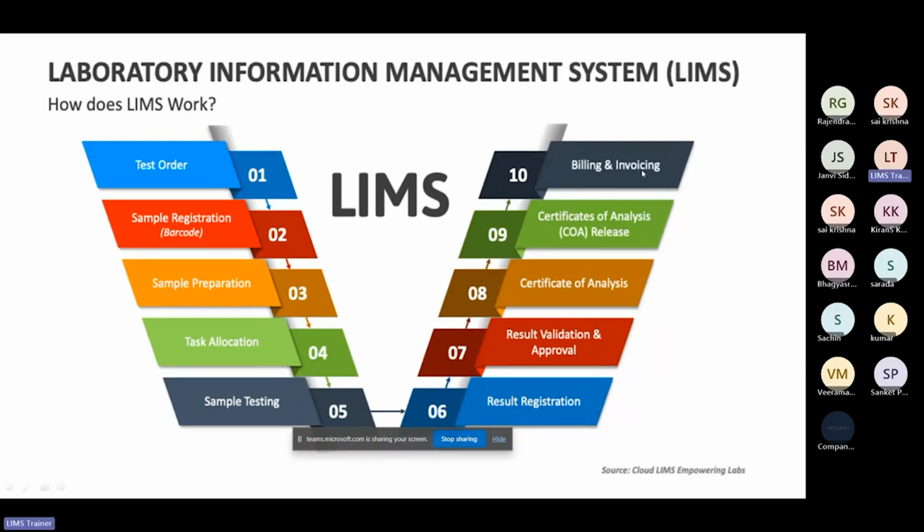Do you all understand validation? Can anybody tell me what is validation? Validation means before going to routine use, you have to validate our software. Here I can say software, LIMS is the software. We have to check whether this software is applicable for our routine use or not. For validating the software, we have certain guideline or document, through which we can validate it.